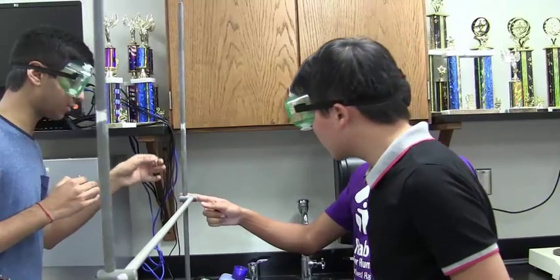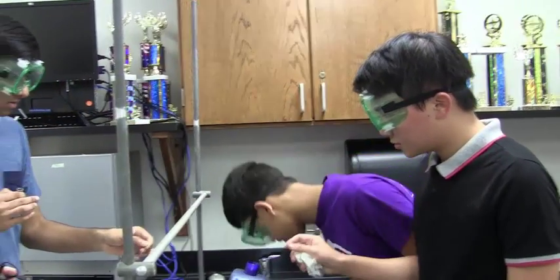So we don't need to keep that one. Yeah, we can keep this. Yeah, we can take this one out. We don't want that one to start evaporating.